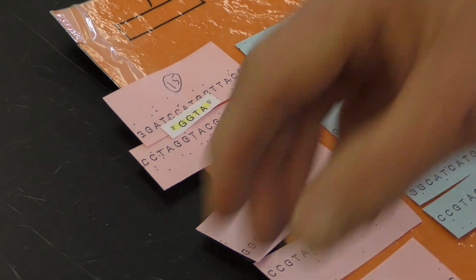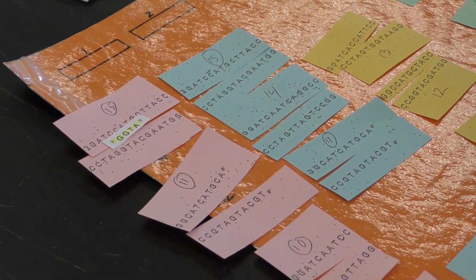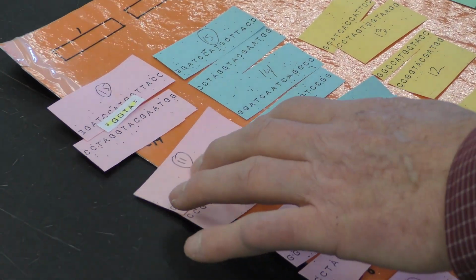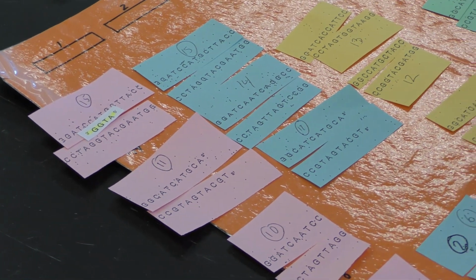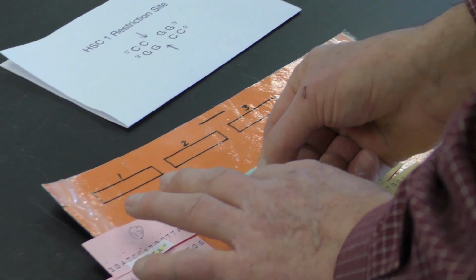Now what your task then is to find how many of those fragments, where would the probe hybridize? So you look through all those, you're looking for a CCAT, okay? Well, here would be another one right next to the CCAT there.